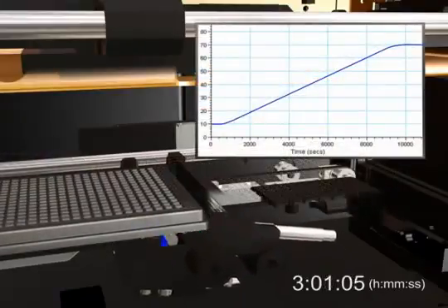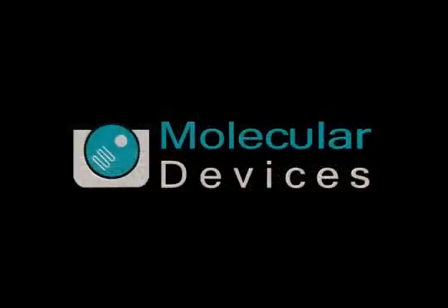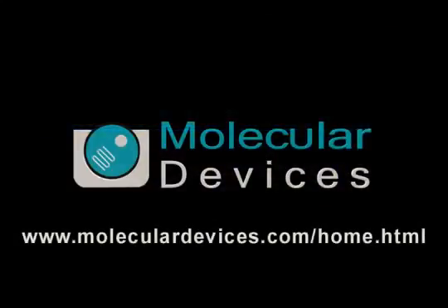The FlexStation3 multi-mode microplate reader with integrated pipetting enables all of your kinetic and fast kinetic applications in the detection modes you need. For more information, please contact your Molecular Devices representative.